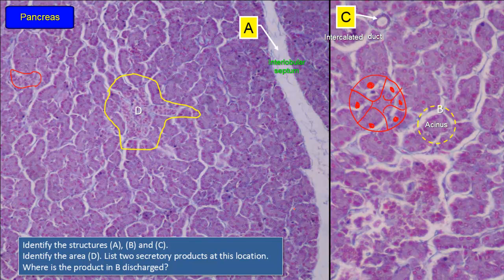This is therefore the pancreas, having both exocrine and endocrine components. The lighter-stained areas are the islets of Langerhans. Islet cells produce glucagon, insulin, and somatostatin, designated as alpha, beta, and delta cells respectively. However, these cells cannot be differentiated from each other by conventional stains. Since the islets of Langerhans are the endocrine part, there is no duct associated with them — the cells secrete their products into the blood via a rich network of capillaries.